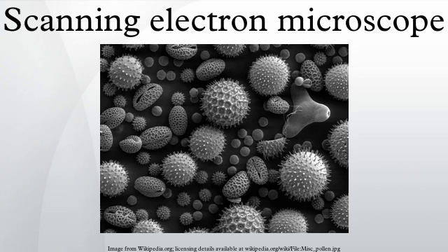ESEM is especially useful for non-metallic and biological materials because coating with carbon or gold is unnecessary. Uncoated plastics and elastomers can be routinely examined, as can uncoated biological samples. Coating can be difficult to reverse, may conceal small features on the surface of the sample and may reduce the value of the results obtained. X-ray analysis is difficult with the coating of a heavy metal, so carbon coatings are routinely used in conventional SEMs, but ESEM makes it possible to perform X-ray microanalysis on uncoated non-conductive specimens.